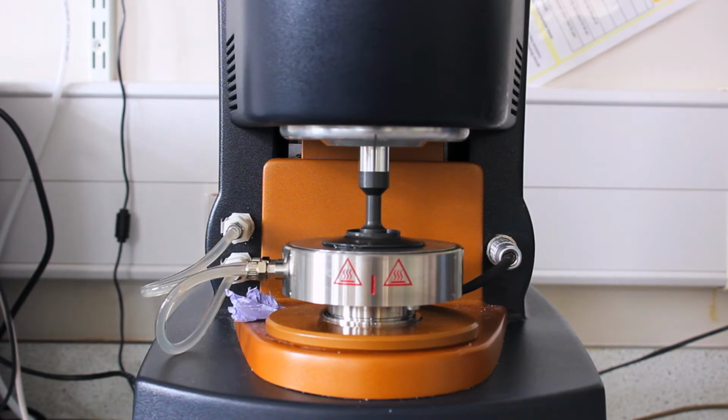We perform rheological characterization on materials in order to understand how they behave when subjected to shear. So we use a piece of equipment called a rheometer, which consists of a geometry, in this case a cone and plate, and a base plate. And by loading the material in a gap between these two surfaces and controlling the rate of rotation of the top plate, we can calculate shear stresses, and from that we can calculate material viscosities, which we can use to then work out Reynolds numbers within our process.